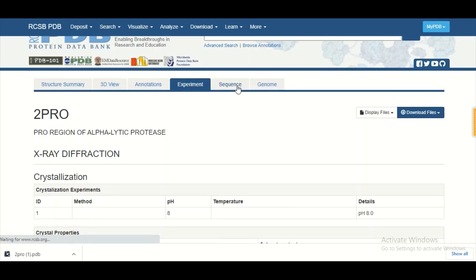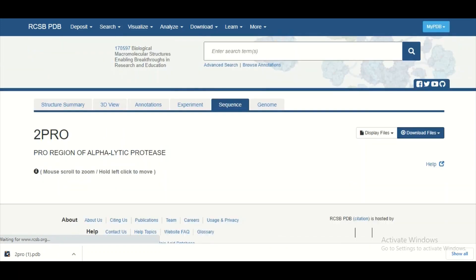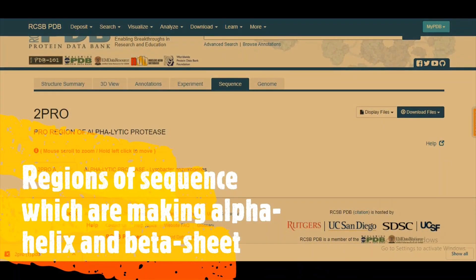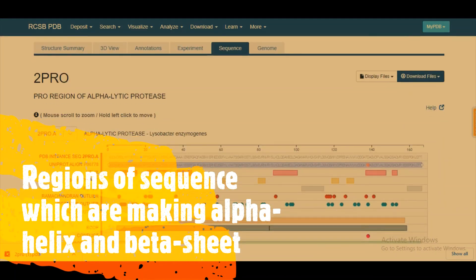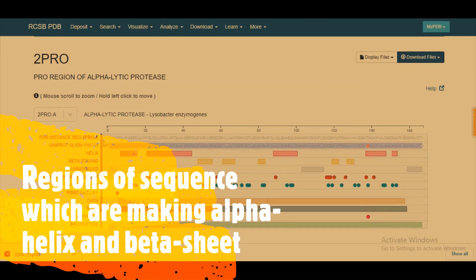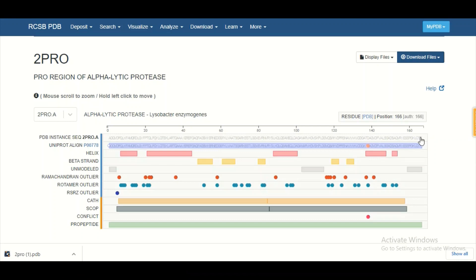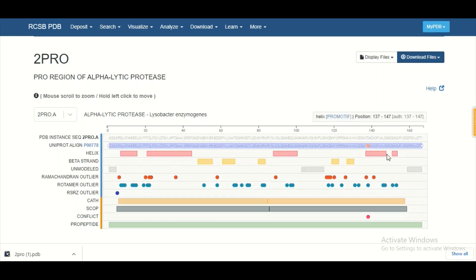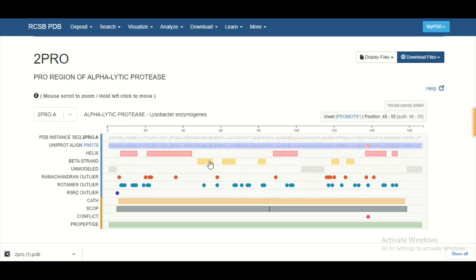On the sequence tab, you can get an idea about the sequence features of your protein, such as where the alpha helices are and which parts of the sequence form beta sheets. At the top, you can see the sequence of the protein, which is approximately 166 total amino acid residues. The red columns indicate regions forming alpha helices, and yellow blocks indicate regions forming beta sheets.